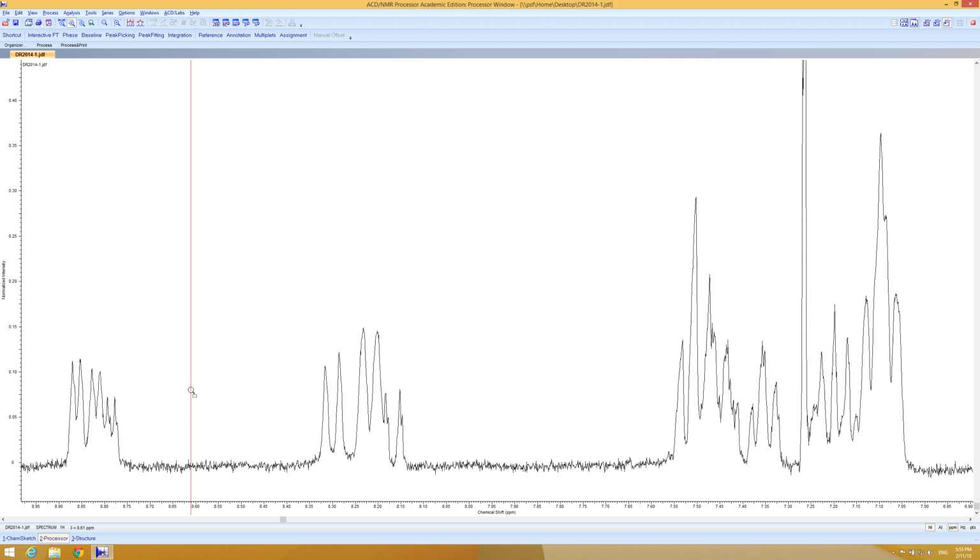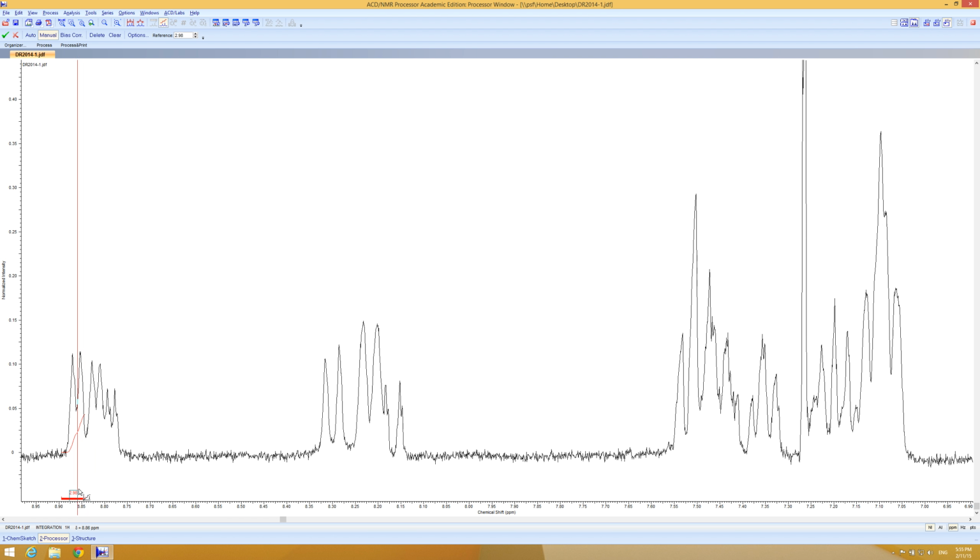Now, this could be really confusing if you don't know what you're looking for. And you may not. But what you should appreciate is that what you've got are a couple peaks right next to each other. Looks funny. One particular thing is that this spectrum is not ridiculously pure, but if we just do the integration, I'll integrate the peaks that they're supposed to be here. And this peak is clearly going to be here. It's supposed to be there.